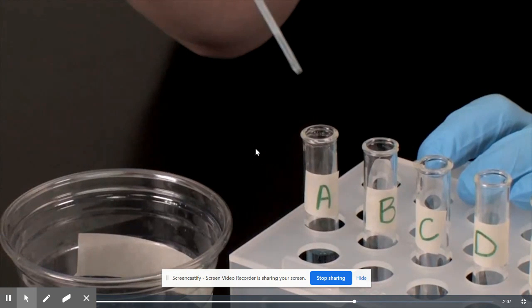All right, so here you did sodium bicarbonate with magnesium sulfate, and it should have been in test tube A. The only class I think that was able to finish this was 6H. But we're going to go over it and watch it on this video. There was a color change. It went from whatever color it started off with to blue. The temperature should have decreased. There was a gas produced. There's no precipitate. So there was a chemical change.